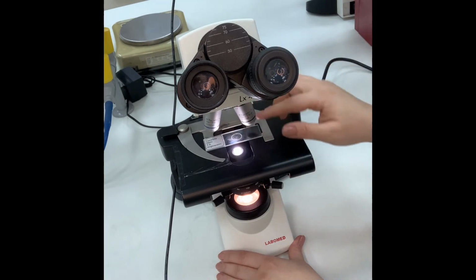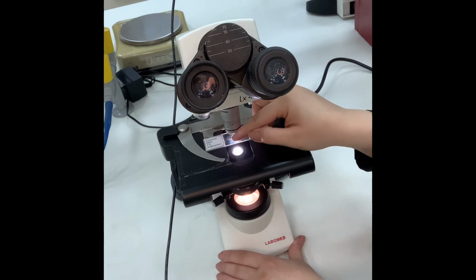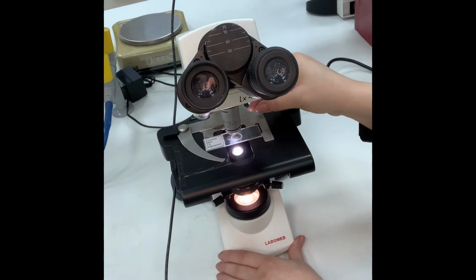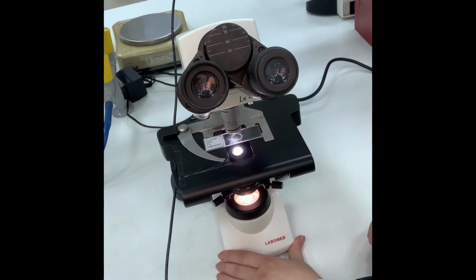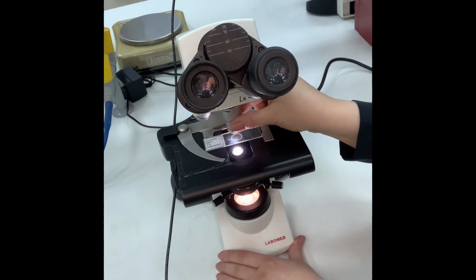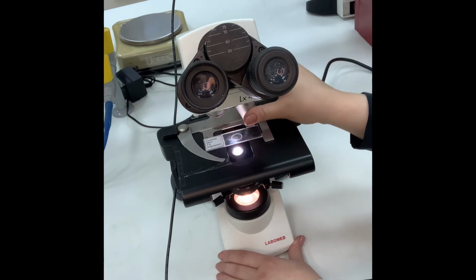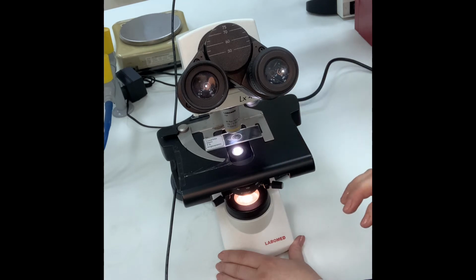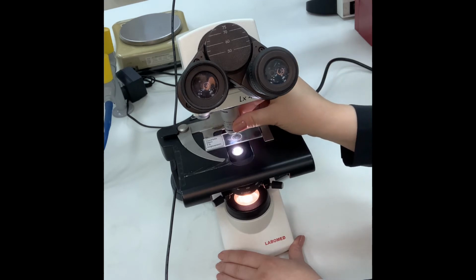But when you use the 100, I have to use a certain oil, just one drop on top of the slide, because objective 100 will touch the slide. And that will cause friction and we will break the slide. So the oil will facilitate the movement of objective 100 only while using objective 100, okay? But for 4x, 10x, 40x, I can move the revolving nose piece freely without even touching the slide. But for 100, it will touch it.